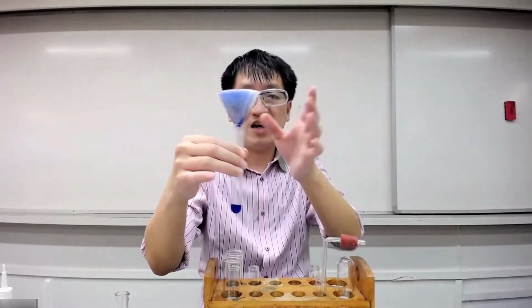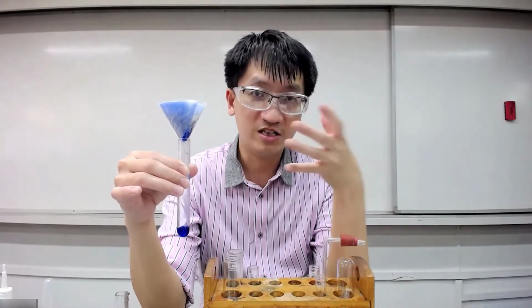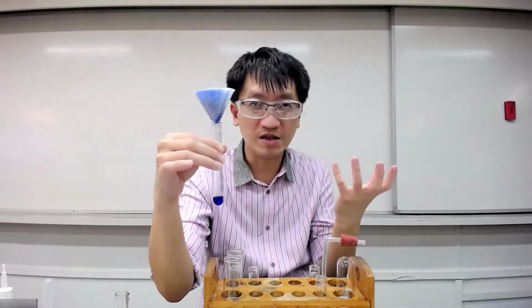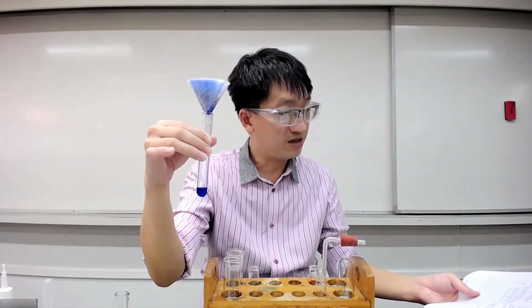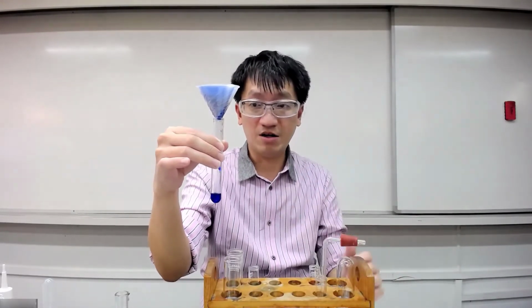So as a student doing practical, you have to be a little bit strategic in the way you work on the experiments. Where possible, you can always move ahead and look at what is likely to happen next and what you're likely to do. These are all very important skills which you should pick up along the way.